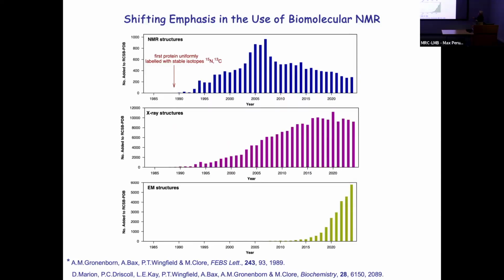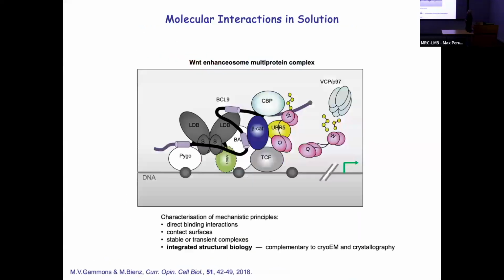If you compare NMR with the depositions for X-ray structures, those are starting to tail off. And of course, the new technique on the block is EM, which is at the moment rising exponentially.